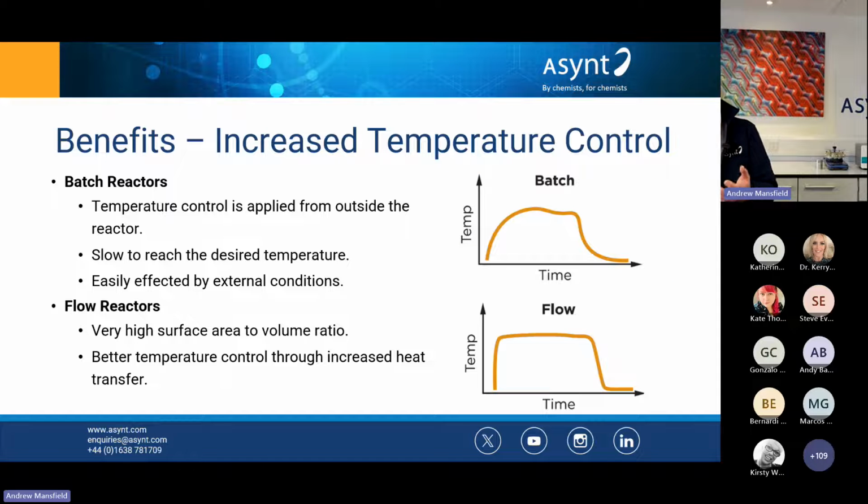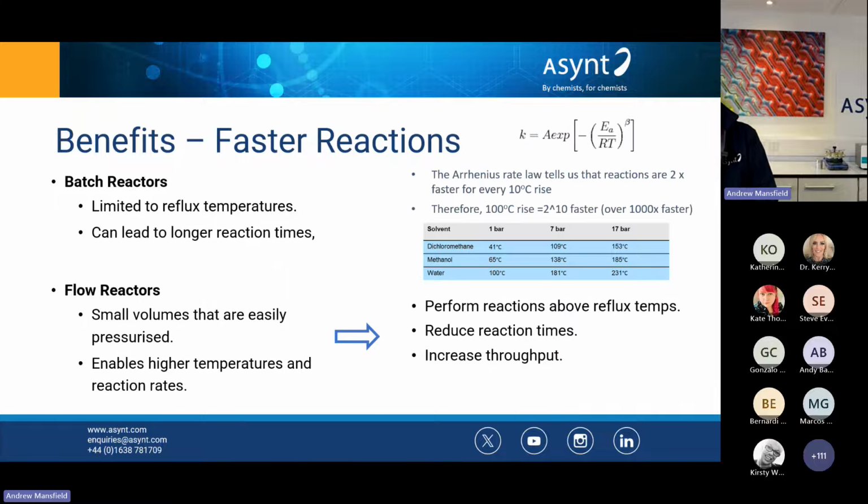So that's heating and mixing and additions, controlling stoichiometry. They're all of those kind of continuous reaction parameters that we can control, and we can automate those very efficiently as well. Adding auto samplers will enable us to look at discontinuous variables, so solvent screening, whether that's a catalyst or an enzyme or reagents or whatever. So I'm going to cover a couple of the benefits. And one of them I said was potentially increasing our reaction rates.